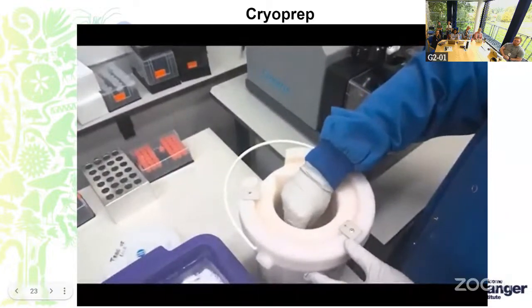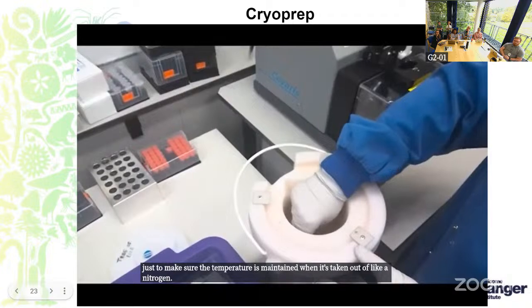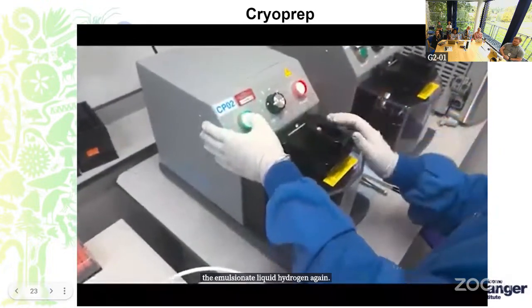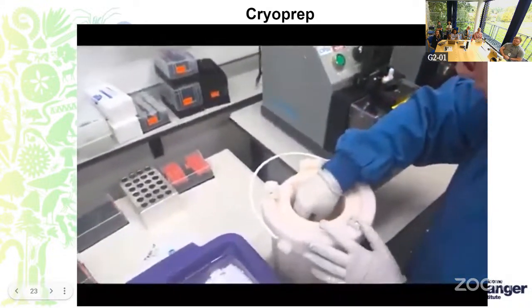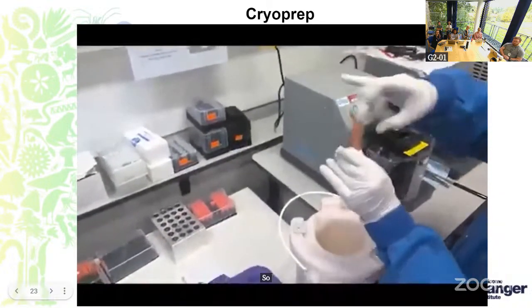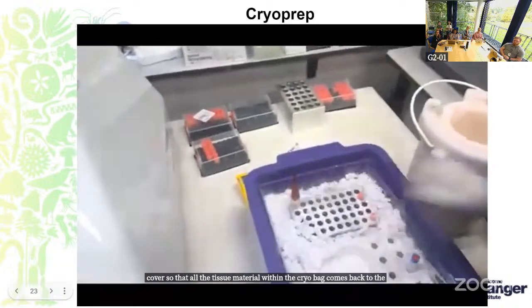We dip and immerse them into liquid nitrogen every time it has an impact, just to make sure the temperature is maintained when it's taken out of liquid nitrogen. Once we are happy with the disruption process, we immerse it in liquid nitrogen again and take the samples out. Once the disruption is done, we invert the tube and then flick the cover so that all the tissue material within the cryo bag comes back to the Fluidex tube, and it's placed on the cold rack.